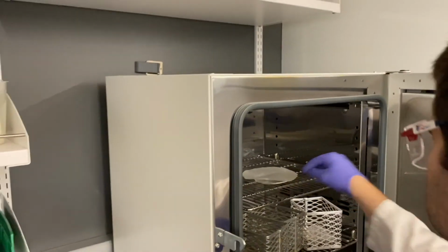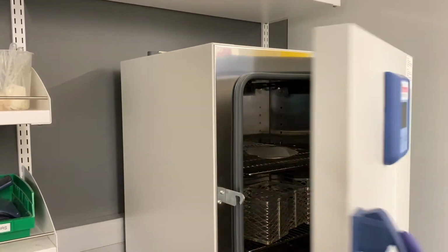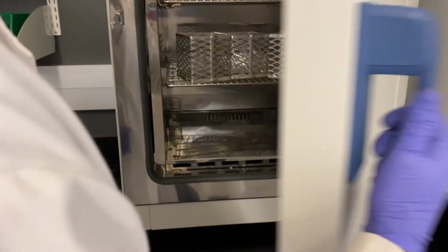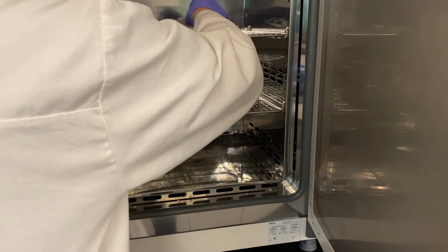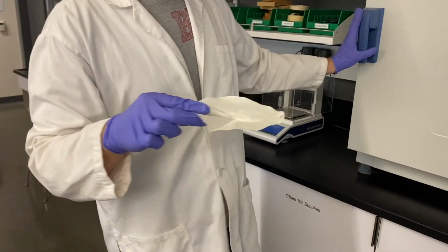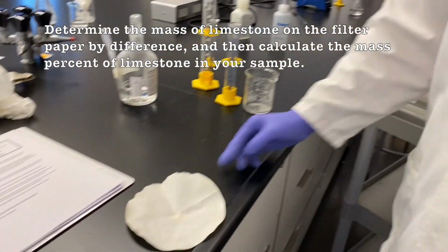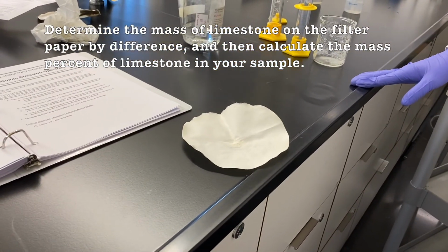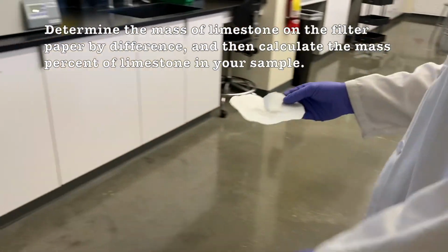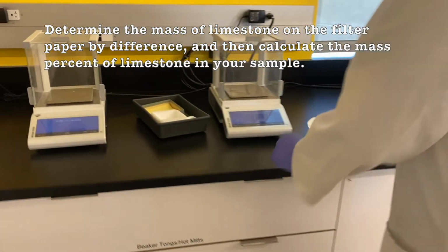And if you ever use one of these ovens, always be very careful. It's at the boiling point of water, which is 100 degrees Celsius. Just take the same precautions as if you're dealing with boiling water. And this time we did a little bit better job of not burning or crisping our filter paper. So there's a learning curve. There is a learning curve.